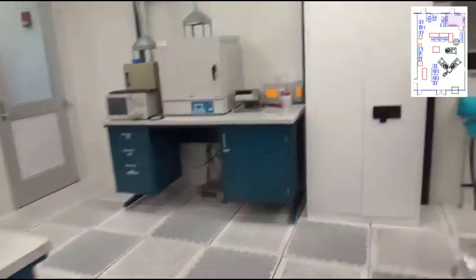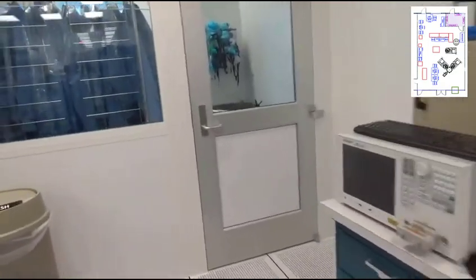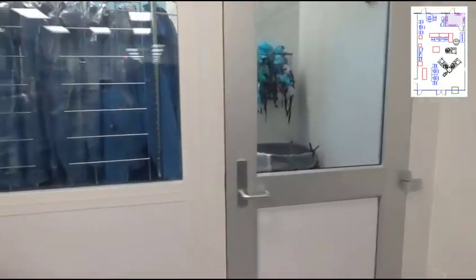Walking out of J-Bay, you pass the ovens on the table closest to the door. All of the equipment in J-Bay requires additional training. Please contact the appropriate staff member to be trained on proper use.